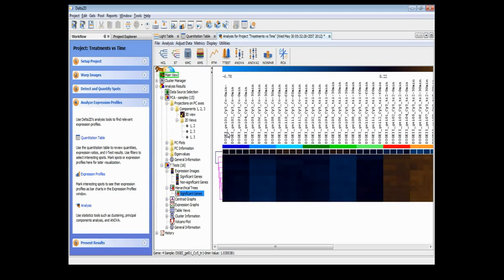By the way, the columns here represent the different images coming from the samples. First we have the control samples, then treatment 1, treatment 2, and then also treatment 3. They are ordered by the time points, and within the time points we have 4 replicates each. And we have studied treatment 1, 30 minutes against 60 minutes, and we should see that there is a certain step variation between this block here and this block here, because these are the images for treatment 1 30 minutes, and these are the ones for treatment 1 60 minutes.